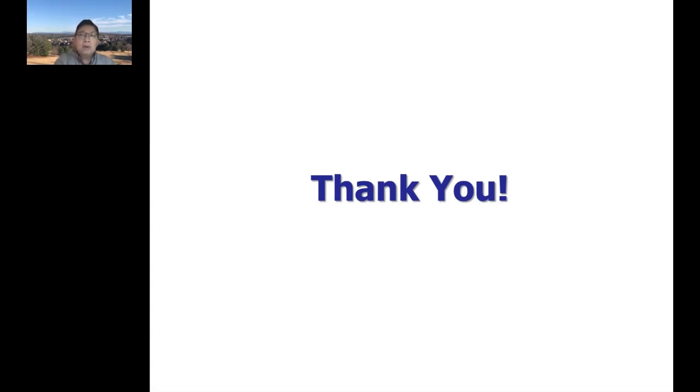That means that I brought experts in the area of Python programming, in the area of interfacing the instruments with the flow chemistry setup, and even bringing the real chemists who can design the experiment with the idea that we can optimize it based on the parameters that we introduce. So overall, automation is a key step towards improving the efficiency and perhaps bringing more creativity. And I like to use the term bringing more engineering to the science because engineering means we can be mindful of parameter control that allow us to do the science more efficiently.